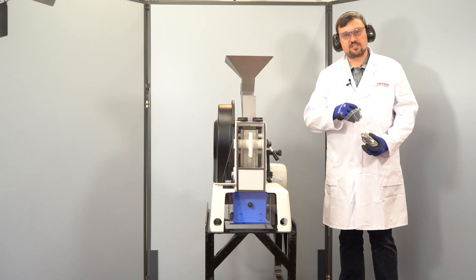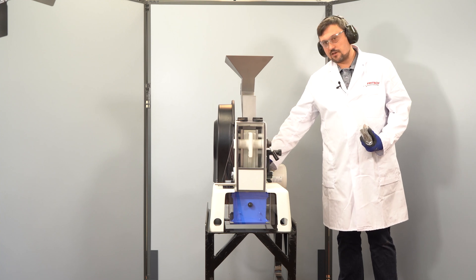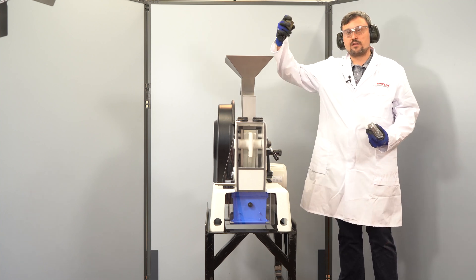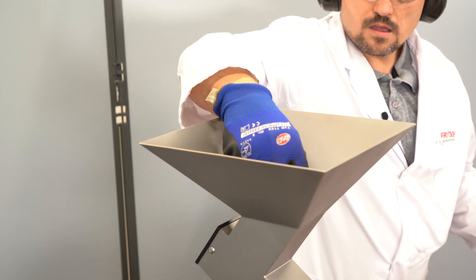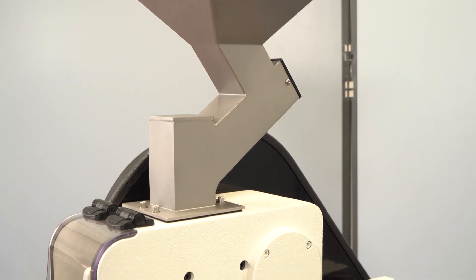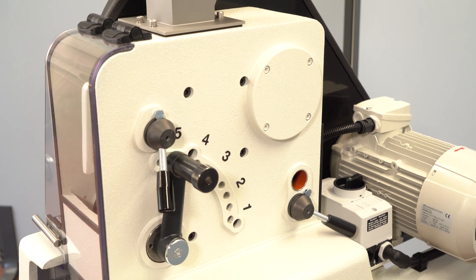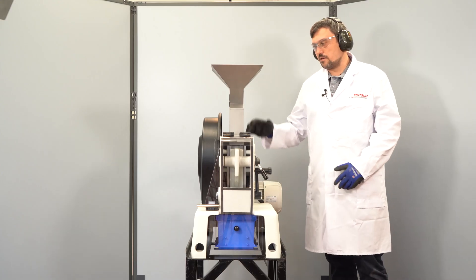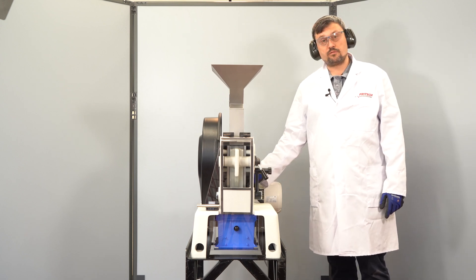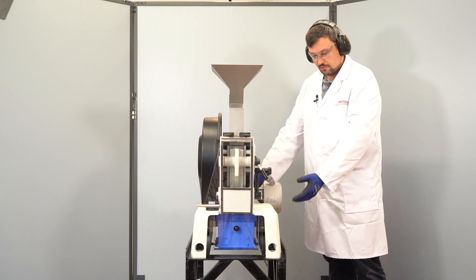Now we want to grind some rock samples. We turn the machine on and wait at least three seconds until the machine reaches its operating sound. Now we put in the sample. After the whole sample is fed into the machine, wait another three seconds before switching off the instrument — this helps deliver the remaining sample into the sample collector.